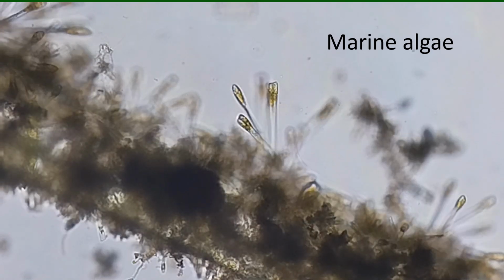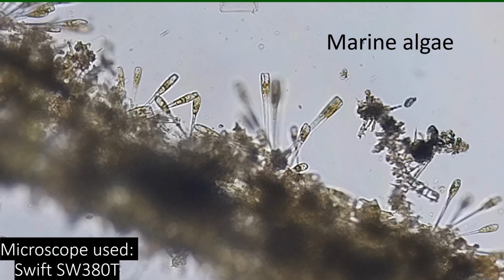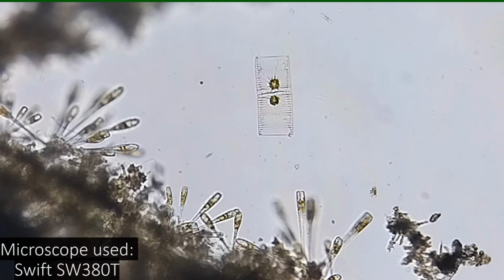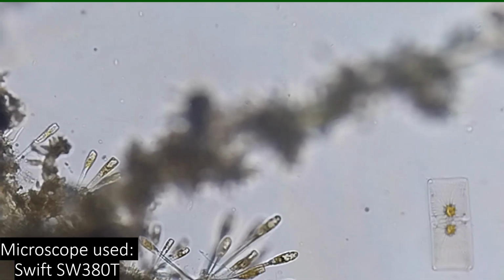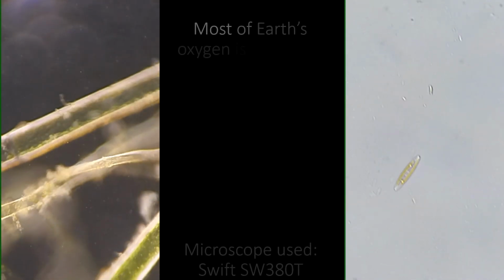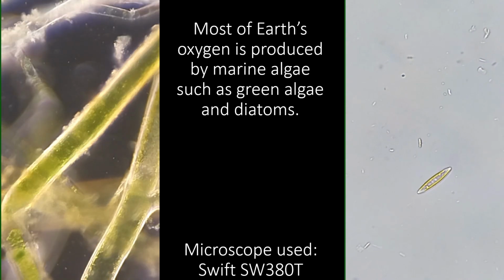Next up, here is some marine algae. Like freshwater algae shown on this channel previously, marine algae produces its own nutrients through photosynthesis, and it produces oxygen in the process. It also serves as a food source for other microorganisms. Most of Earth's oxygen is produced by marine algae such as green algae and diatoms.